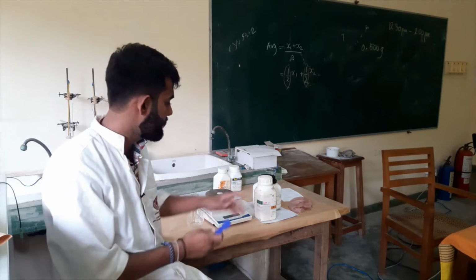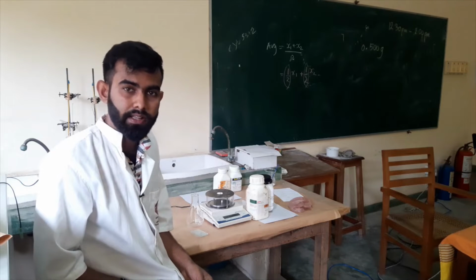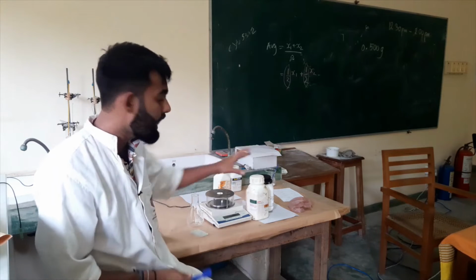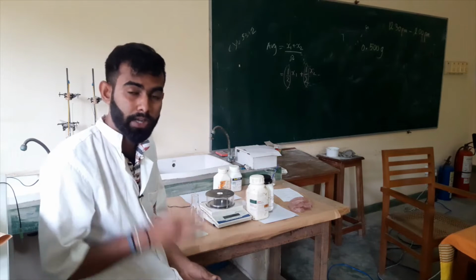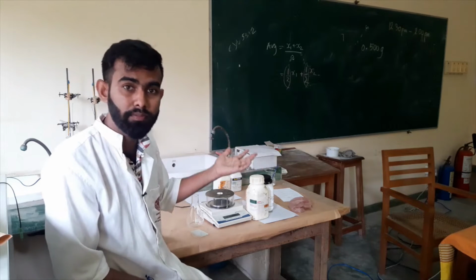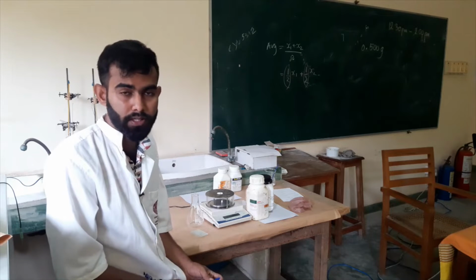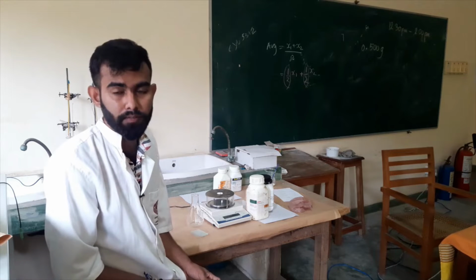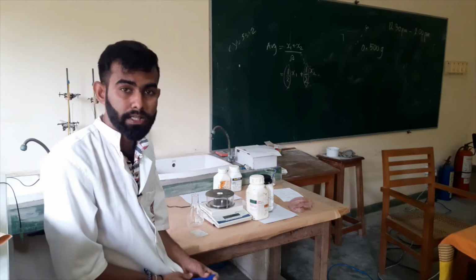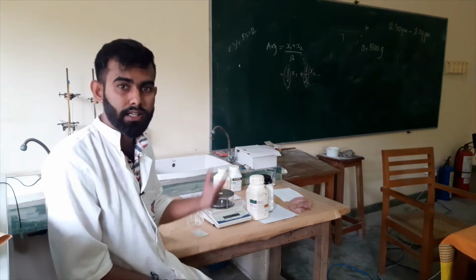You have to remember that we have to take the same amount of both silica gels, and mix them very well. After that we have to add two times water than its weight. For example, if we take 20 grams of each, the total mass will be 40 grams, so you have to add double the amount of water, that means 80 milliliters. If the total mass is 20, you have to add 40 milliliters of water. Likewise, you have to add double the amount of water than the measured total weight.